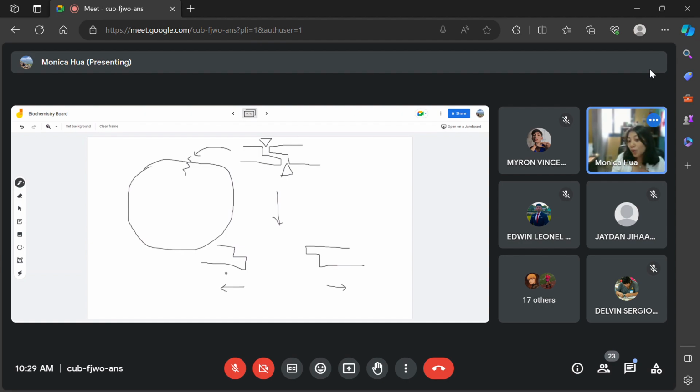Now, let's say we have a sequence we want to insert. On the ends of the sequence, we want to add similar DNA, so that instead of sticking back to itself, it's going to stick to our DNA sequence.